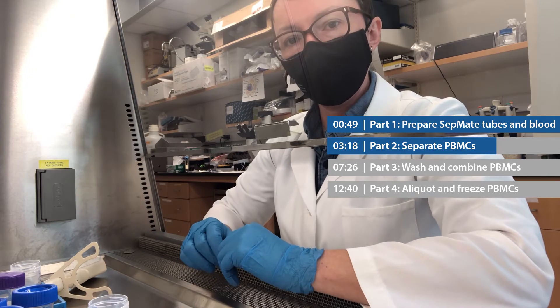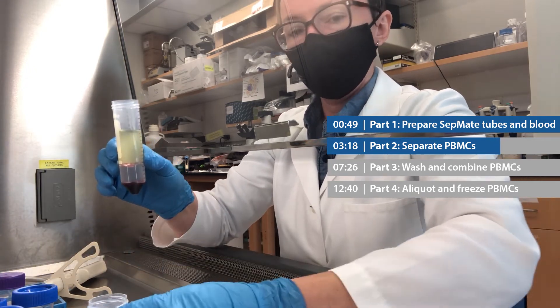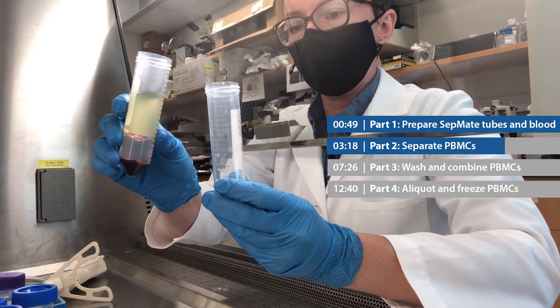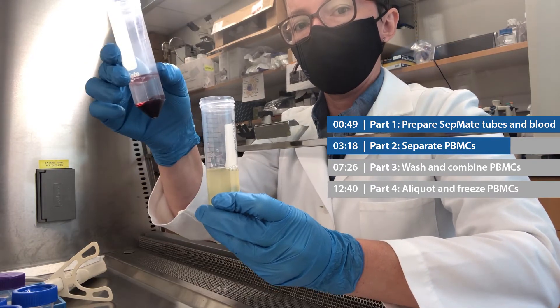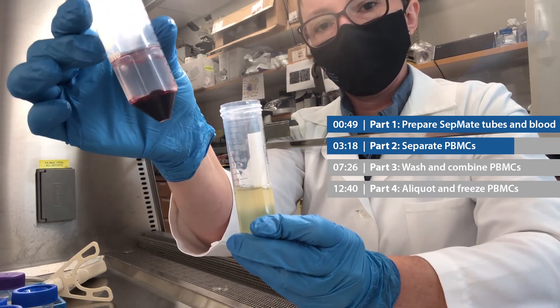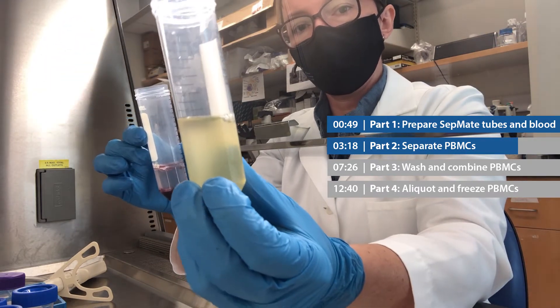Now I'm ready to pour off my PBMCs from my SepMate tube into a clean, empty 50 ml conical. I'm going to invert the SepMate tube in one smooth, confident motion. One, two, right side up again. What you should be left with is your red blood cells — those can get thrown away — and your plasma plus your PBMCs.